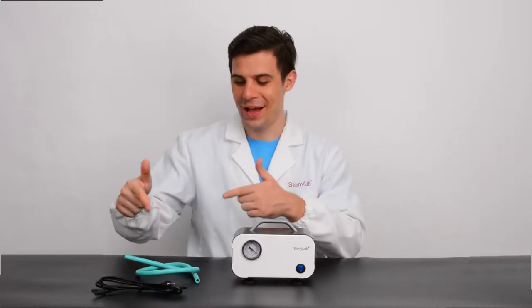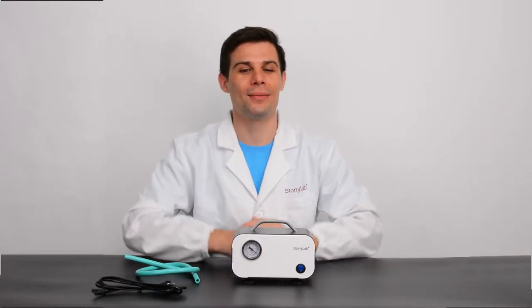Hi everyone! Welcome to StonyLab and this is our new product, a vacuum pump. It is a portable, oil-free diaphragm vacuum pump.